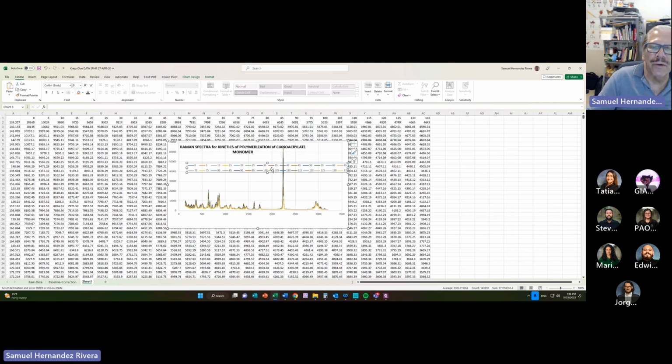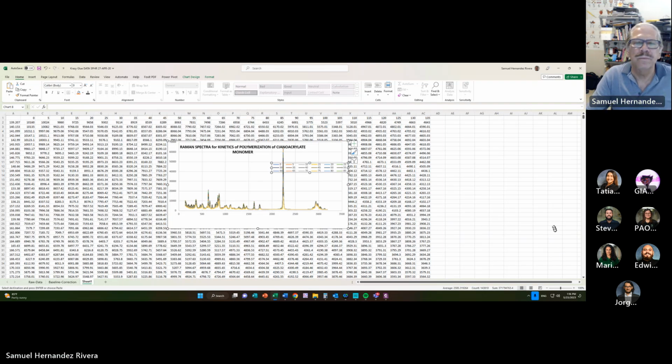We don't want to mess around with it, at least not much. There we go. Okay, I think we can optimize a little bit better. Good.